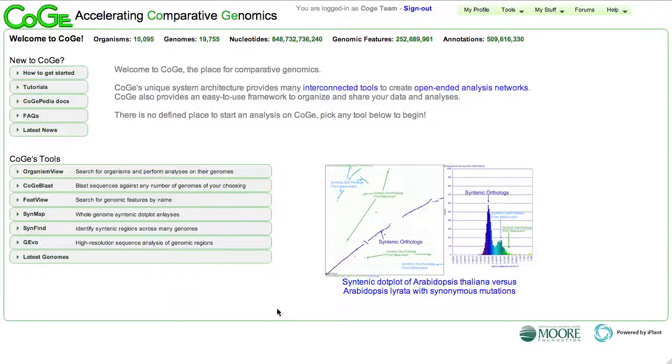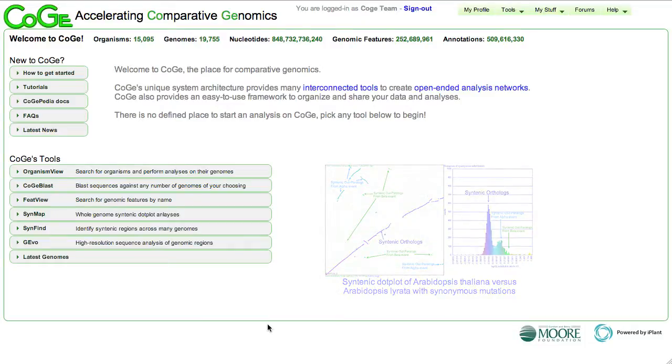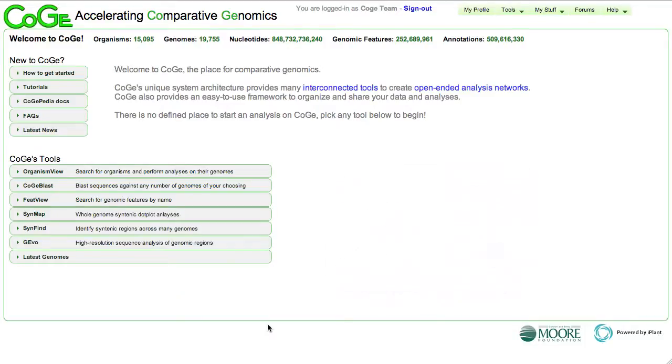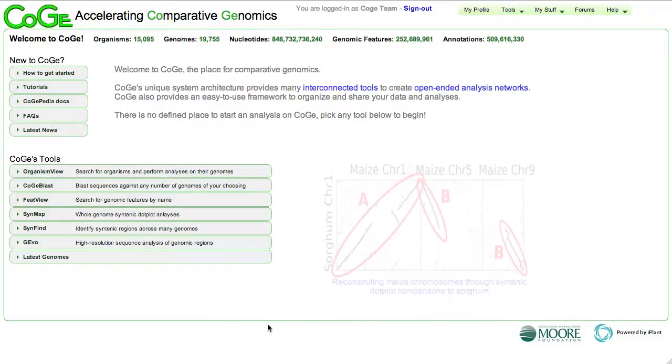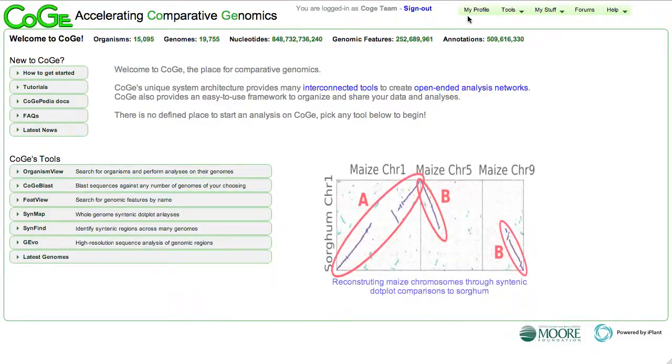Hi, this is Eric Lyons, and this is a video demonstration of CoGe's new genome visualization system known as EPIC-CoGe.